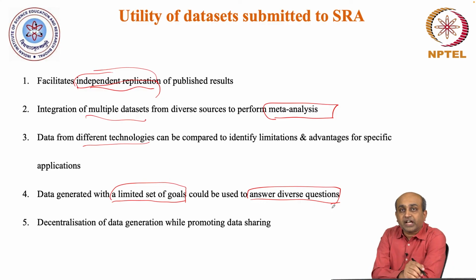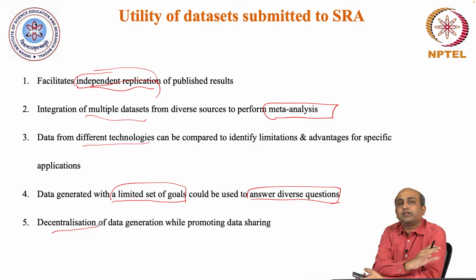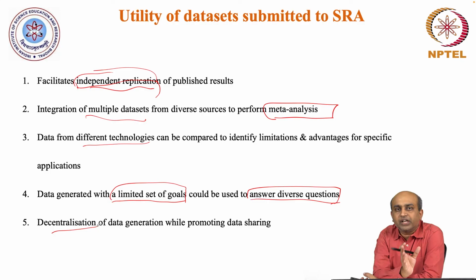And since this data is stored on SRA, it's somewhat decentralized, in the sense that data can be generated by very different people, all of it is stored on SRA, and the data generators are not monopolizing the analysis.